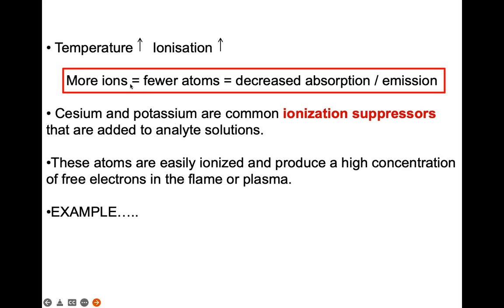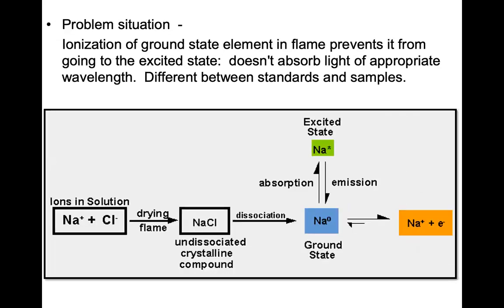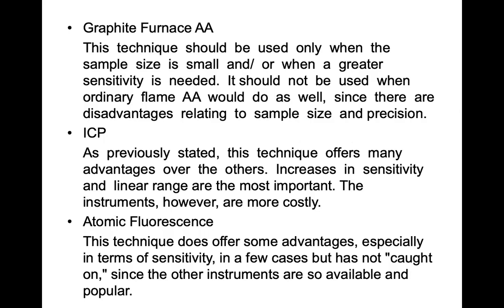You can see that more ions, fewer atoms, means decreased absorption. We don't want this decreased absorption because in terms of quantitative analysis, it will not be accurate.